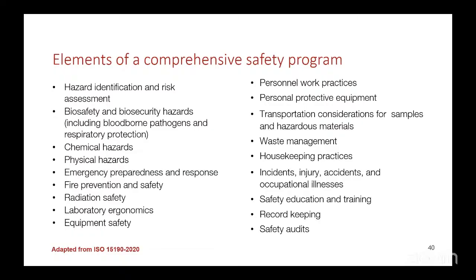So other aspects of a comprehensive safety program include having biosafety and biosecurity hazards, including blood-borne pathogens and respiratory protection, chemical hazards, physical hazards, emergency preparedness and response. What is your emergency preparedness response? Both policies and programs that are put in place.